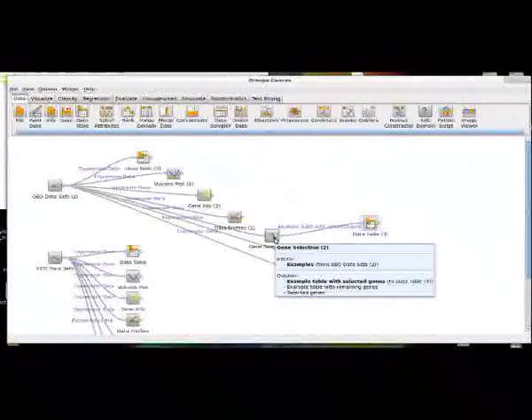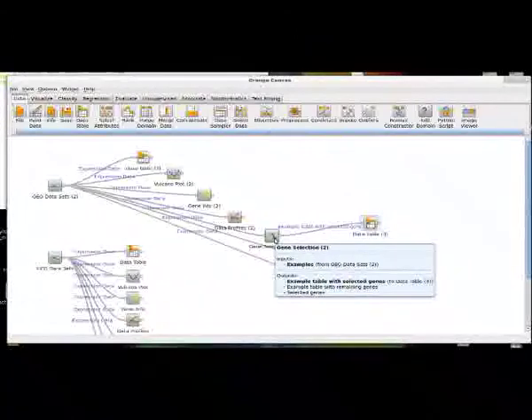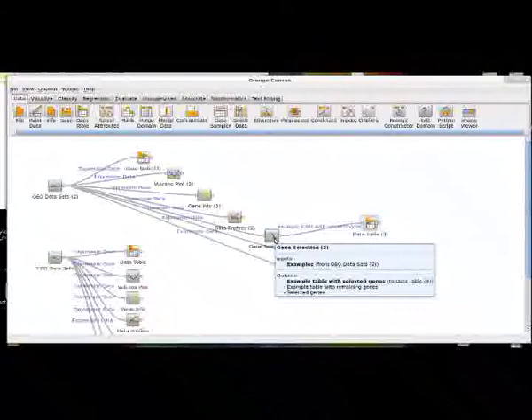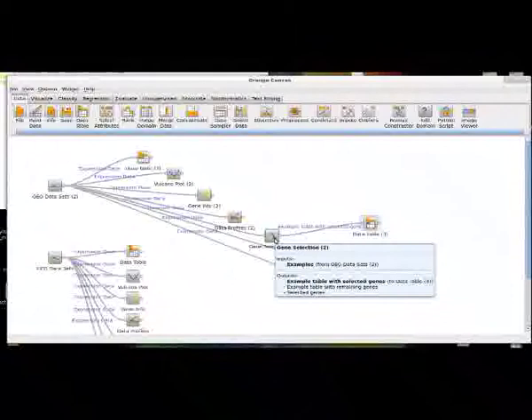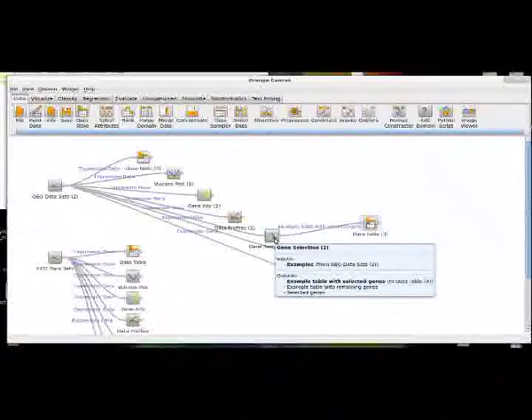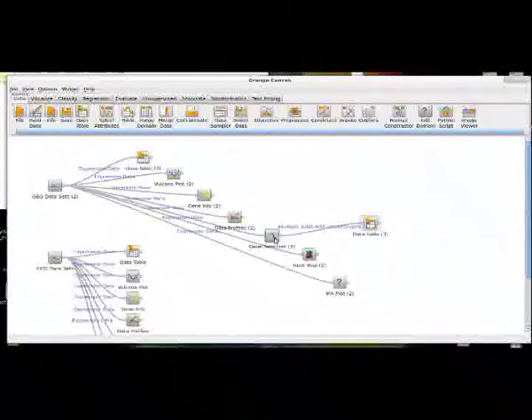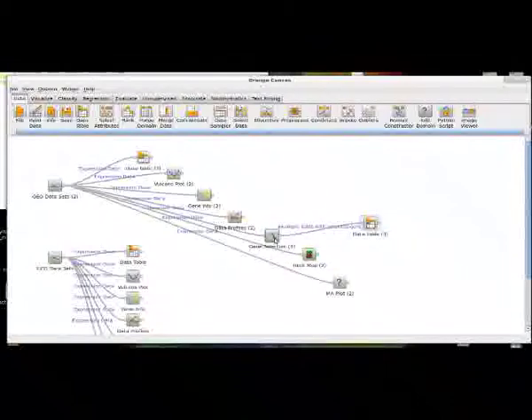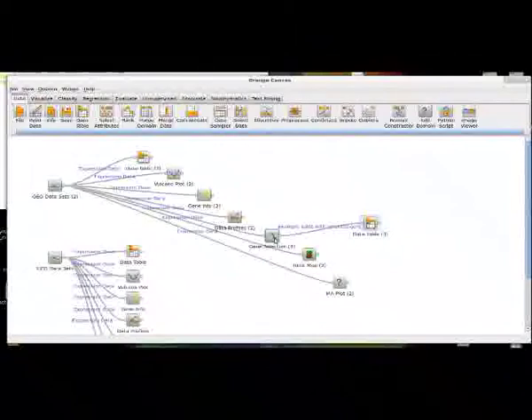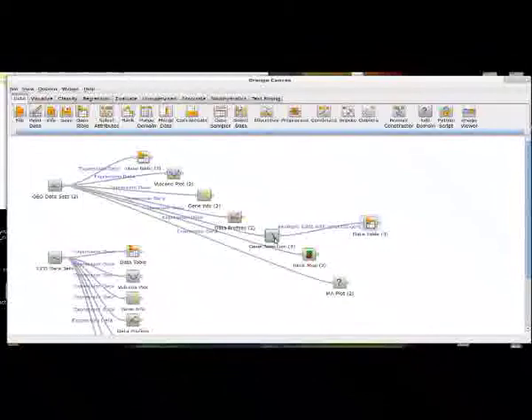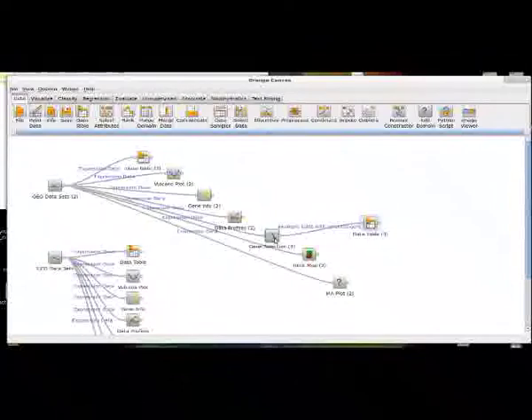So when you're dealing with bioinformatic data, and especially like we're looking at now, we're looking at mRNA expression data, we're trying to find genes of interest. We're trying to figure out, of our different classes, which are going to, in this example, be tissue types, which means that our kind of goal is to learn about what are the genetic indicators that, or the genetic causes that make these cells differentiate from each other.